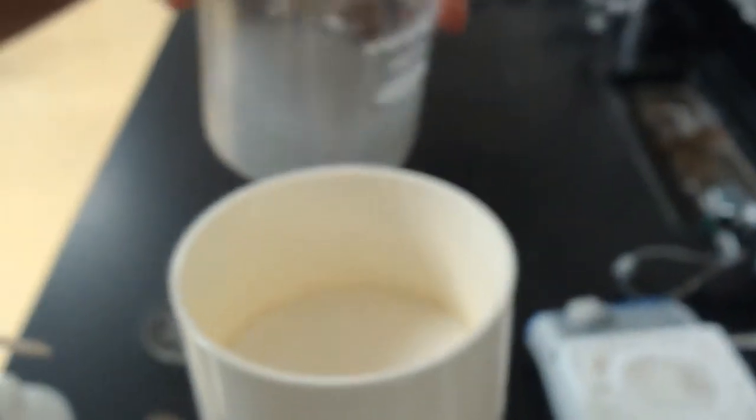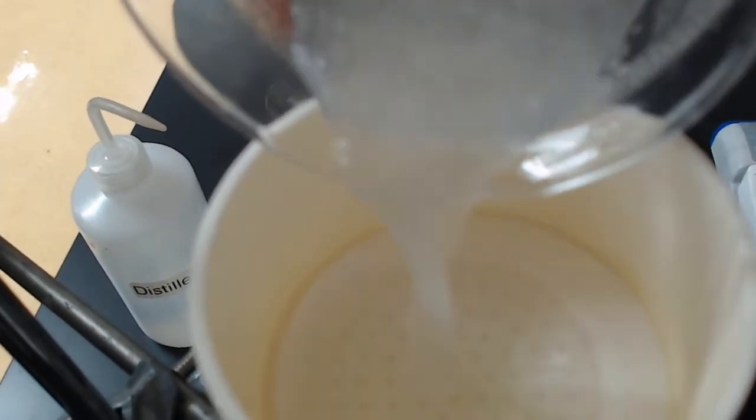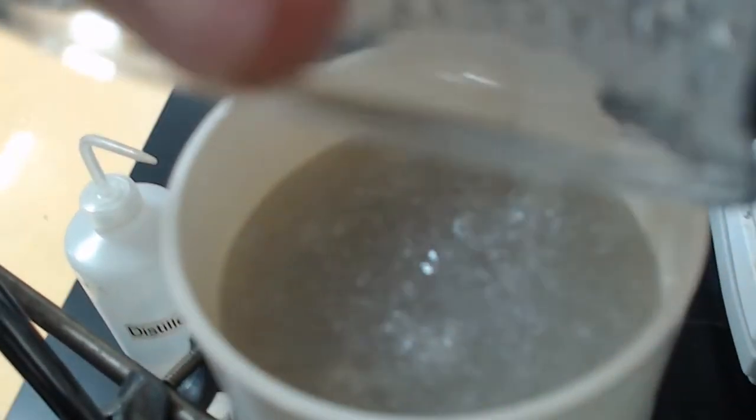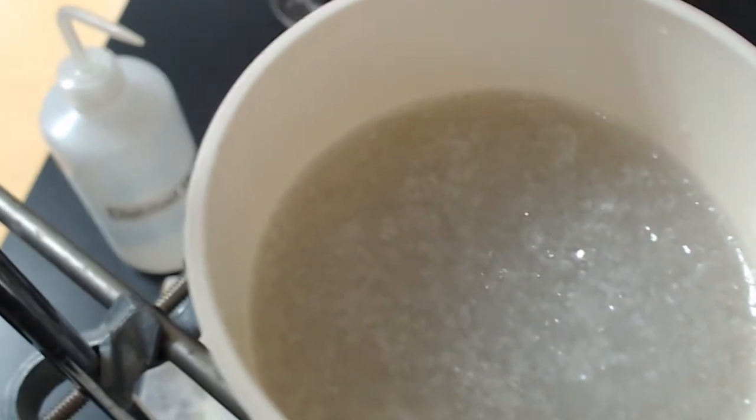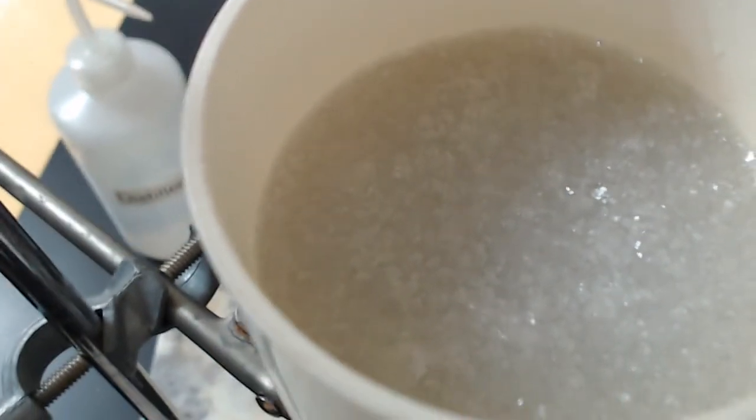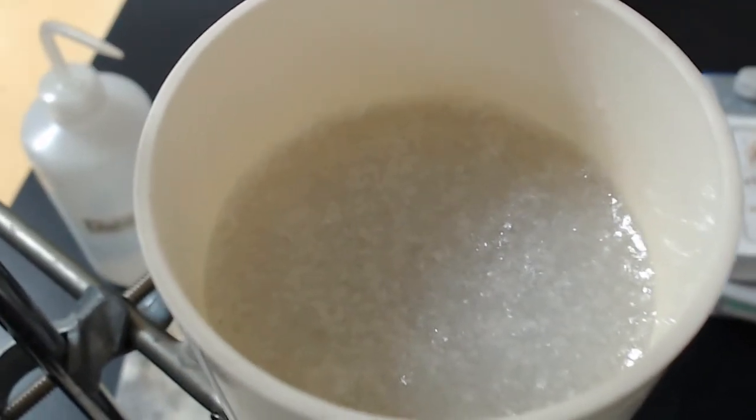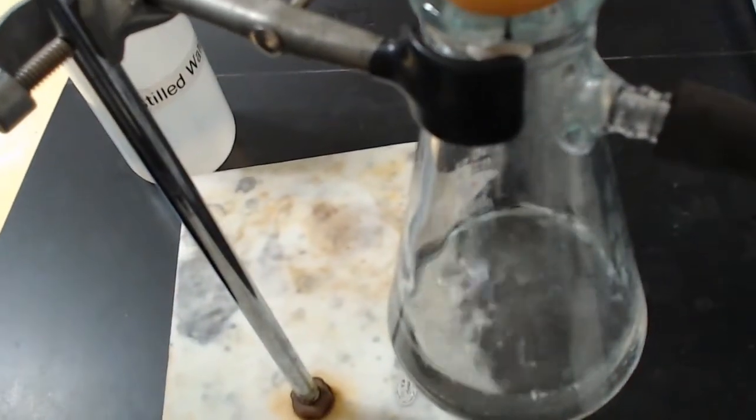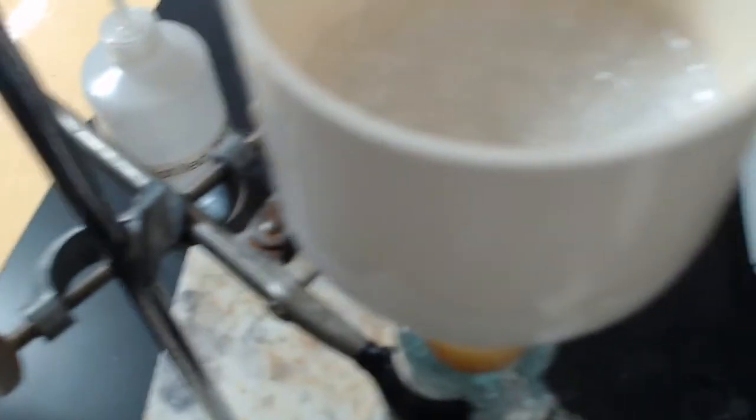And then this part, you want to make sure that you swirl this, have it in a slurry, and just try to pour it all at once. And pure acetanilide looks kind of like glitter when it's pure. You should see nothing coming through. Just pure acetanilide crystals on the top. And then typically you want to leave it on the vacuum for about 10 minutes to dry off any of the water.